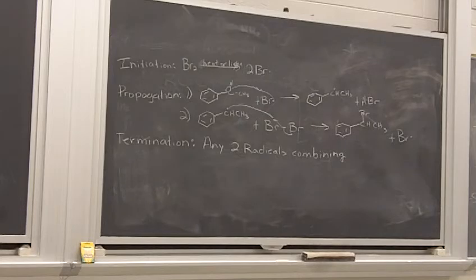as well as part 3, we're going to have another radical, with radical polymerization. So for the pre-lab though, in our reaction section, do we need to show just those ones up there, or do we need to show all of it? Well, that was I think what the question was, and to start with, yes, those are your reactions, but because so much is going on and so much is involved with the different reactants in this case, it would be a good idea to also show the steps of your radical chain reaction.